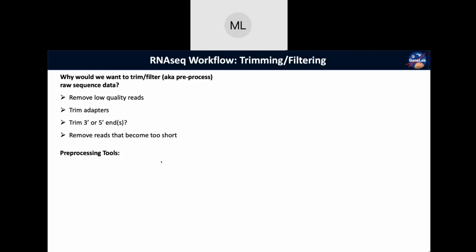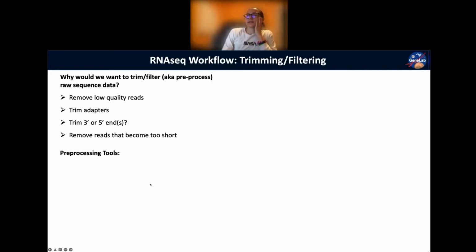Thanks, Mike. Does that answer your question, Susie? Great. Good question. It's always important to keep in mind what your original input is that you're looking at when assessing quality, as Mike was mentioning.